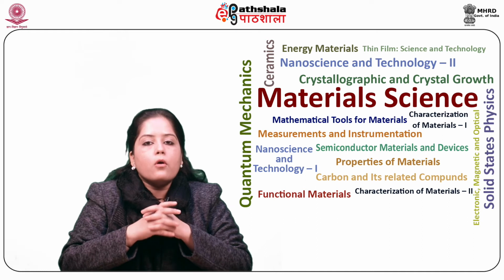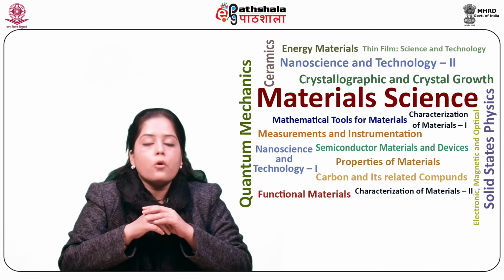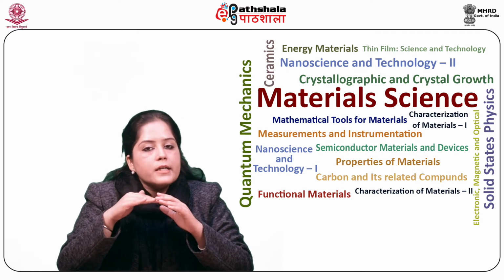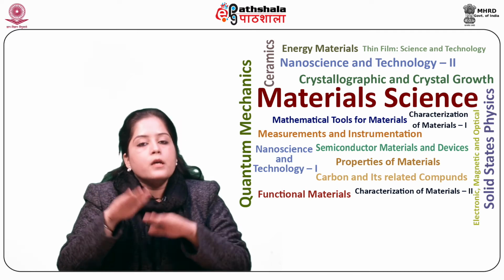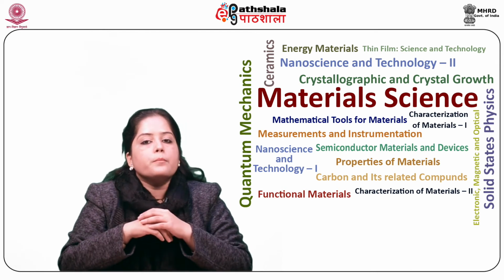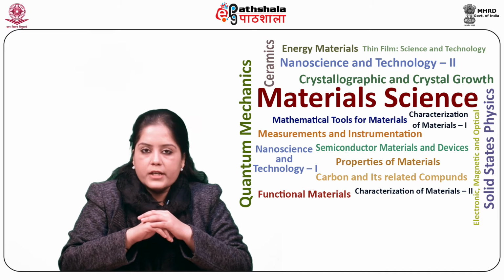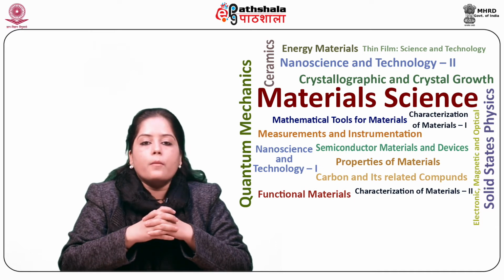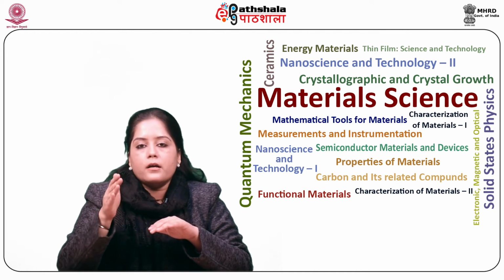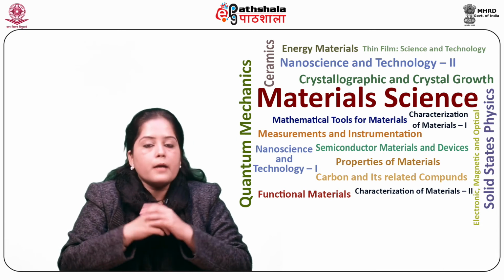So the static mode or the contact mode is the original and the simplest mode to operate an AFM. In this mode, the probe is in continuous contact with the sample while the probe raster scans the surface. In other words, the probe drags across the sample. The most common configuration of static mode is to operate it in the constant force or deflection feedback mode. In this mode, the cantilever deflection is the feedback parameter.